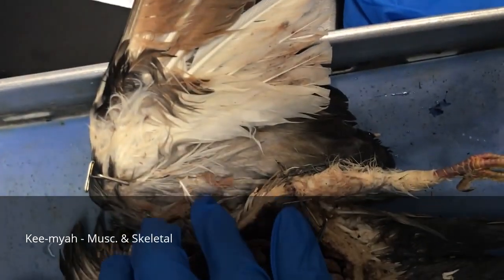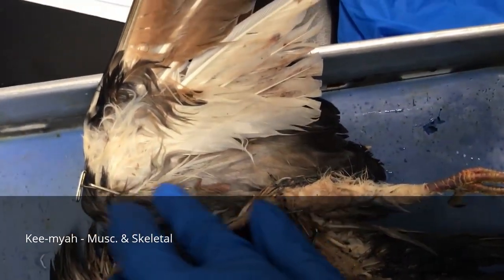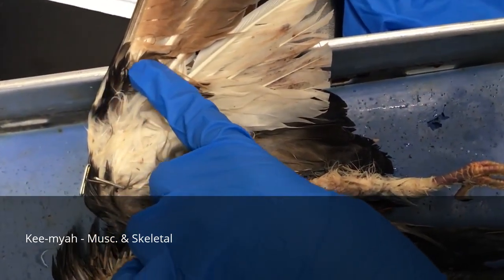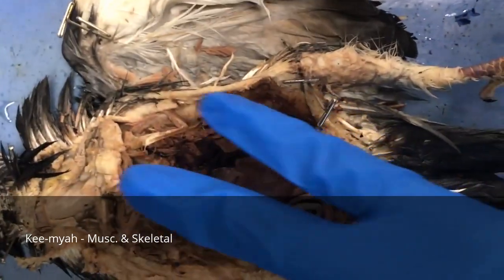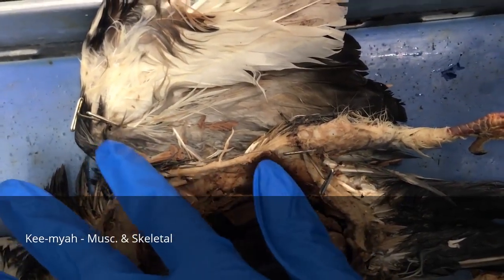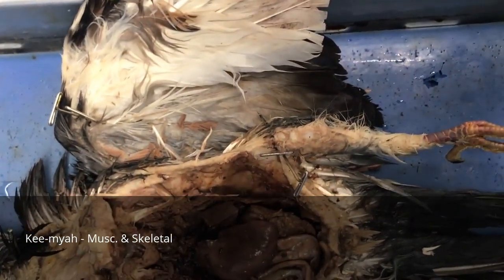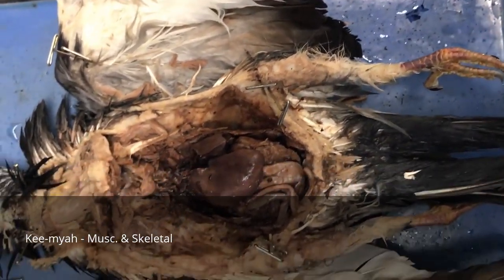So here on the inside of the wing, we have the flexor digitorum sublimis, and we have the interosseous palmaris, the part that we cut out earlier. It would be the pectoral muscles, and these muscles are highly developed versus the muscles in the back and the legs because they aid in flight.